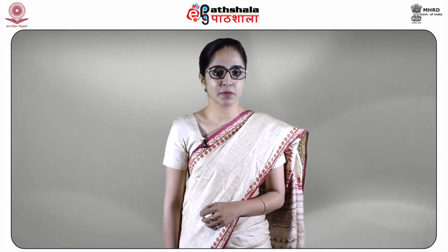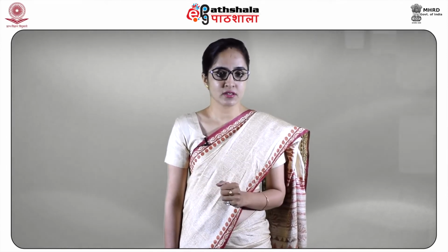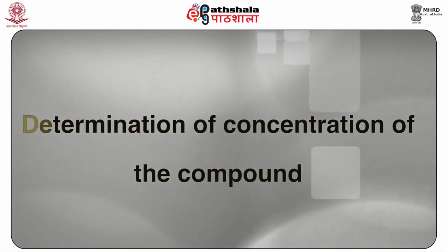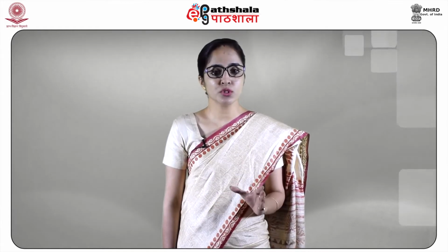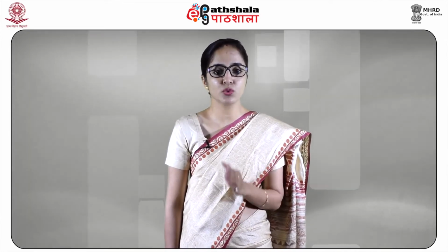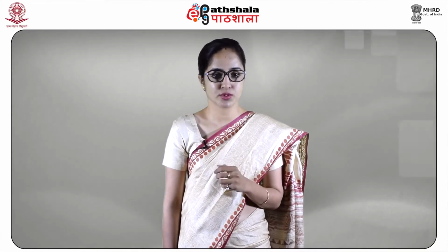Now students, taking another aspect of UV visible spectroscopic applications is the quantitative analysis of various compounds. The first in this would be determination of the concentration of the compound. UV absorption spectroscopy can be used for the quantitative determination of compounds which absorb UV radiation. Now, this determination is based on Beer's law, which relates the absorbance of the substance at a particular wavelength to the concentration C as follows.